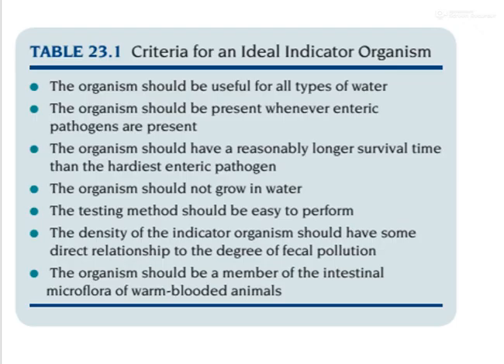Before I move on to the microbiological examination of water, which microbes do we have to identify within water? That is of very much importance. We know that it is not practical always to find out all the pathogens which have been present within the water because pathogens are of a wide variety. So we choose to find out indicator organisms within the water.